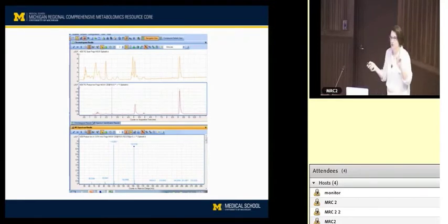In other words, you can say that these actually represent a single formula, but with different connectivity of the atoms. So even if you have perfect mass accuracy, you may still see multiple peaks, because anytime you have a metabolite that has the same atoms, it's going to have the same mass. If your chromatography is good and you can separate those out, then that's ideal.